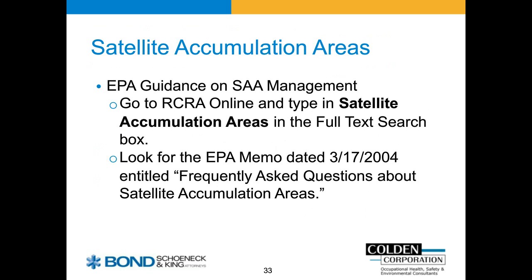Back again to our RCRA Online. I would invite you to go to RCRA Online and type in satellite accumulation areas in the full text search, and there's one particular EPA memo entitled Frequently Asked Questions About Satellite Accumulation Areas. There are a number of great questions there in terms of scenarios that oftentimes come up. I'll just select one, which is question 14 in that particular guidance memo.